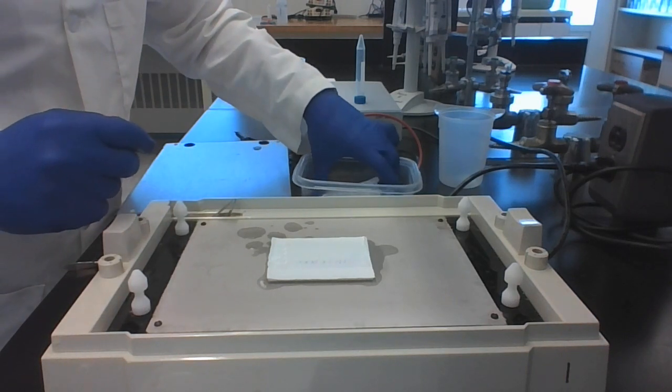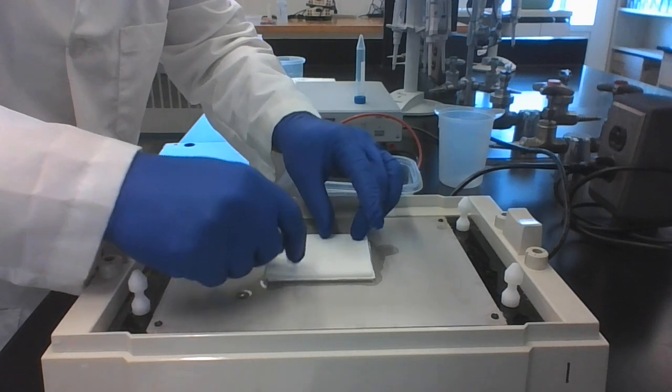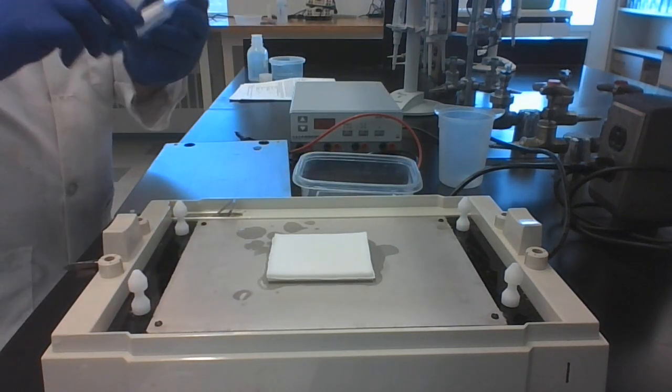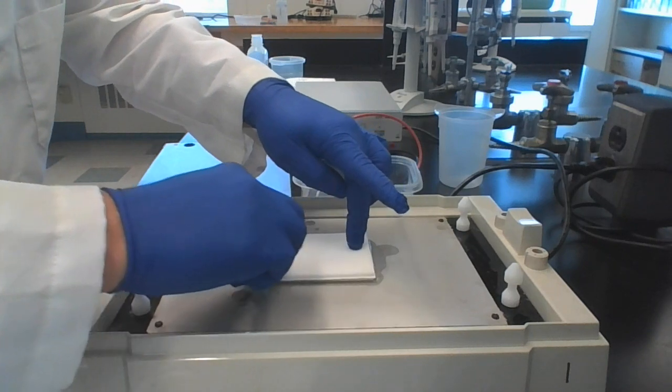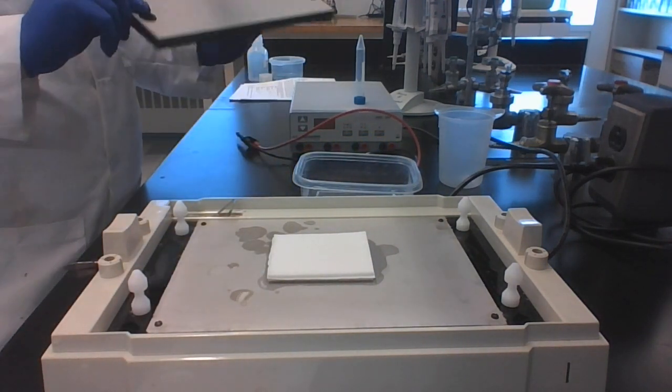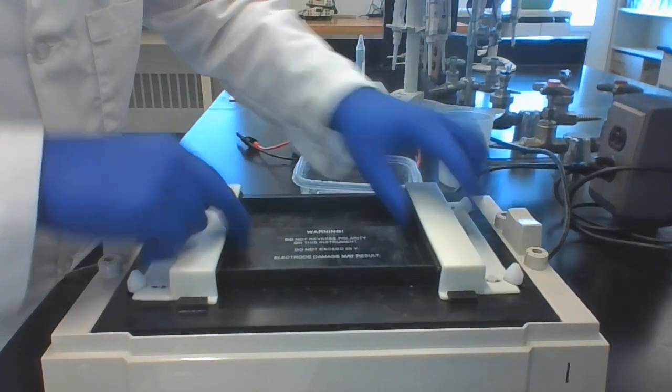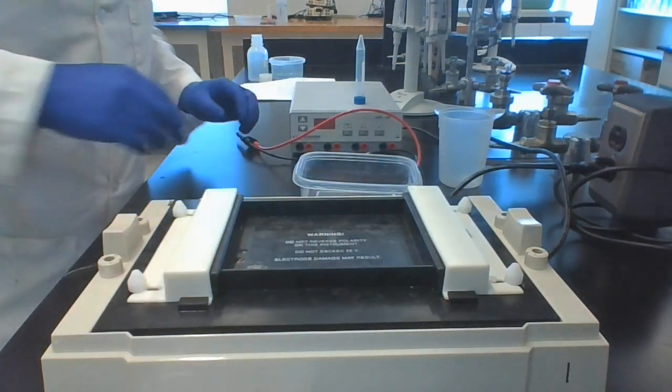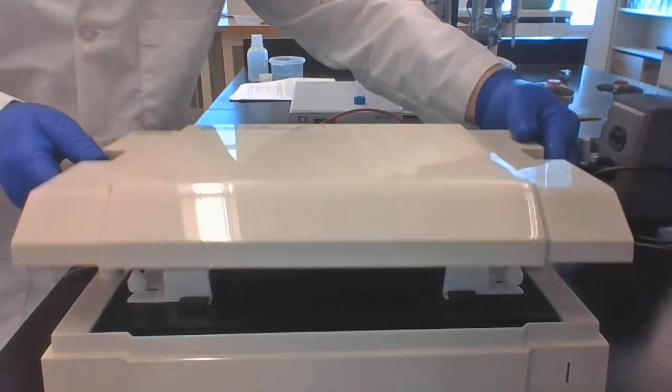On top of all that goes the next filter paper. Once this is all together, we just take our tube and we make sure that we roll out any of the bubbles. We then place our negative electrode on top.